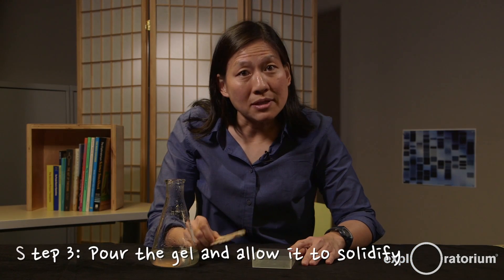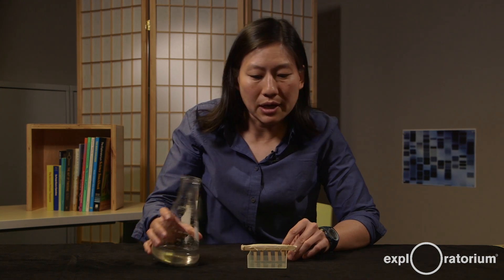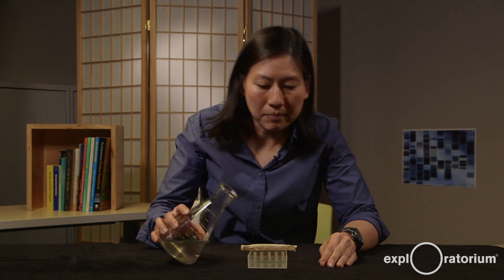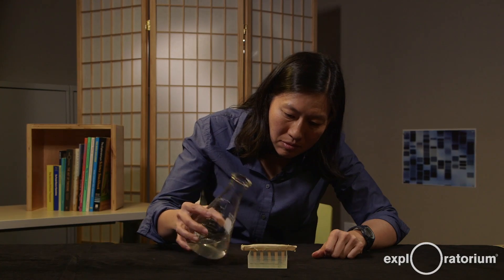Now that you have your comb, your box, and your gel solution, we're going to pour the gel so it gets ready to load samples. Put your comb into your box a few centimeters from one end, then pour just enough gel to submerge just a few millimeters of the comb — we're only making very small wells. A thin gel runs faster; I'm impatient so I'll pour a thin gel. Once poured, set your box somewhere it can sit undisturbed until it solidifies at room temperature.